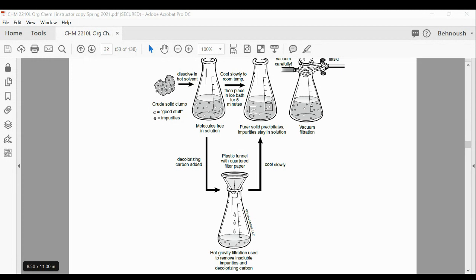These are like rock sugar. Don't know if you see it or not. Basically, they make a saturated solution syrup of sugar in water, and then they place this plastic straw or stirrer. This basically acts as a seed also.